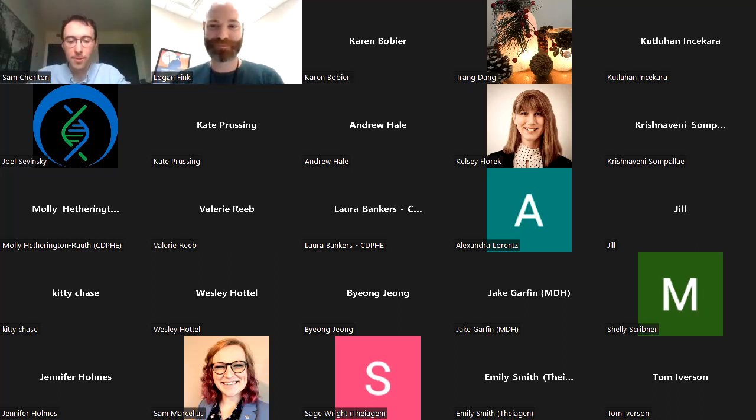Yes, the goal is to open source large parts of our code. Some parts of our code are open source already. The key BugSeq taxonomic binner is open sourced, attached to that Nature Communications Biology publication. If you go into the supplementary material of that, you'll be able to find the code. The host scrubber, I just saw linked in the chat. Some of our nanopore things are open source, like Porechop. This isn't us, but we built off of it, or forked it. That is open source, the ability to trim nanopore adapters. And there are a couple other pieces that are open source. Our goal is to continue contributing back to the community because, again, we really see value in that.